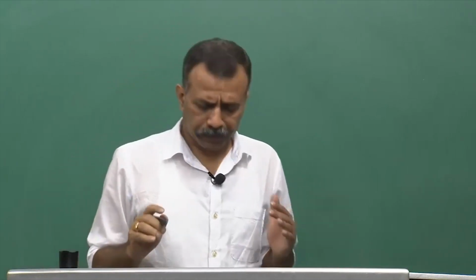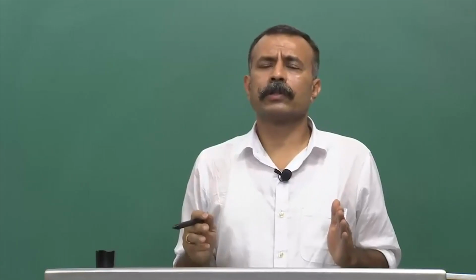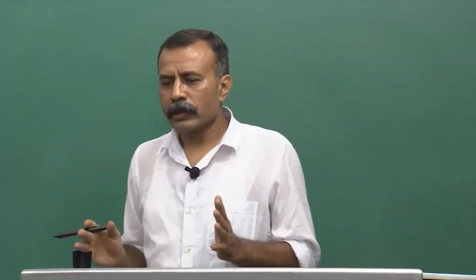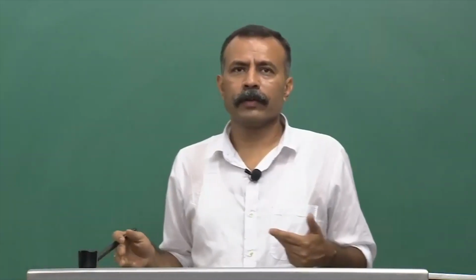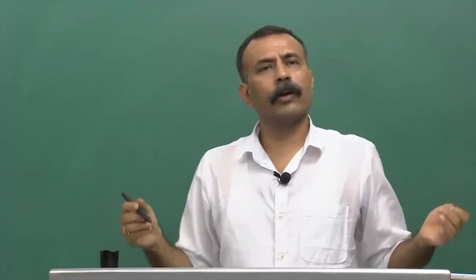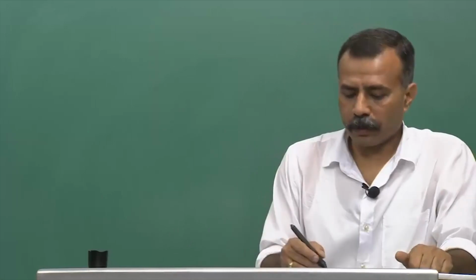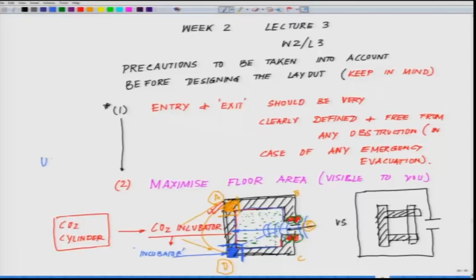Now think of it, how trivial this sounds, because I know somebody will think, what a big deal, this guy is talking about such things. But when you are planning a lab, you have to realize that tomorrow you will be a leader, you are planning a lab, and somebody will tell you, set up this facility. The first thing you have to figure out is how many users there are. Say, the number of users, so there will be an N which comes out of it. Number of users.